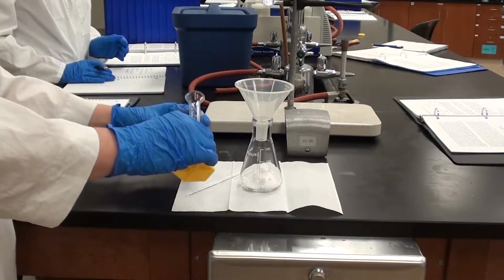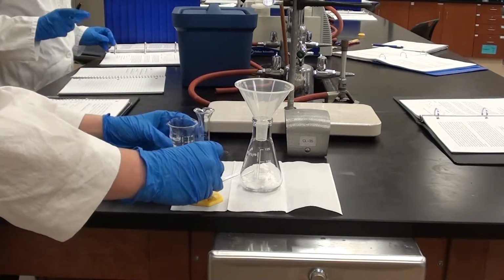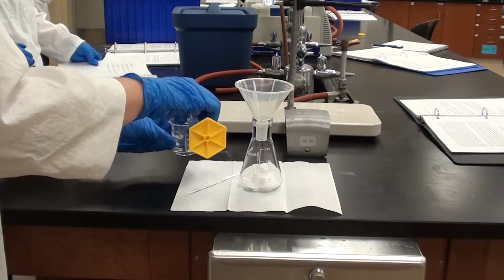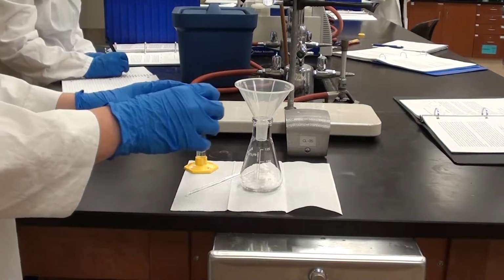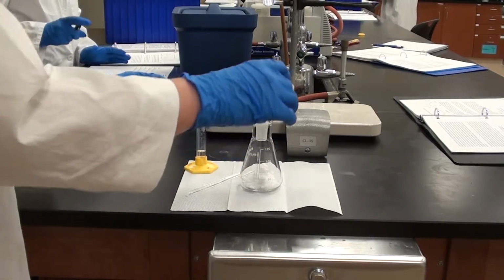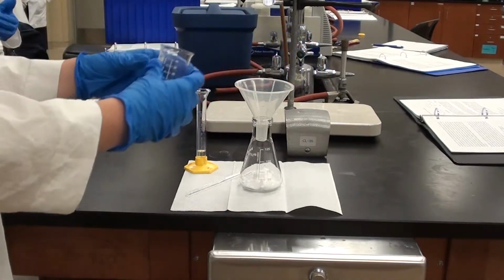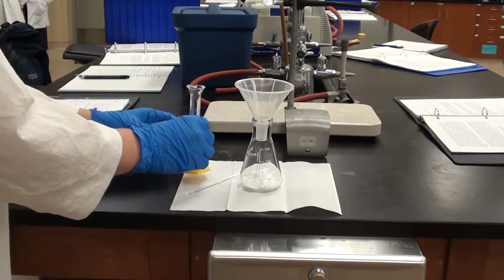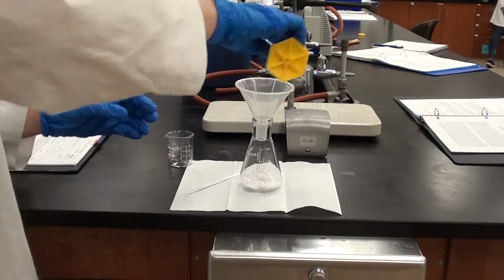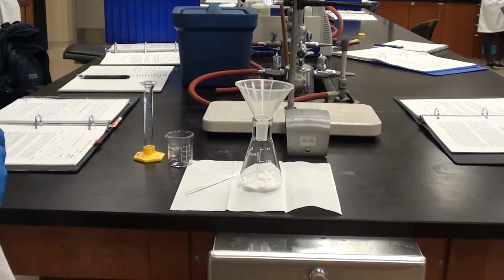Okay, now she's going to add about half of it to the beaker. I know it's only a small amount there. But she's just using that to sort of rinse out the beaker. There we go. That's good. And then the rest of it, you can just go ahead and add that into the funnel. There we go. So the next step then will be to add 3 to 4 drops of concentrated sulfuric acid. We'll do that in the fume hood.